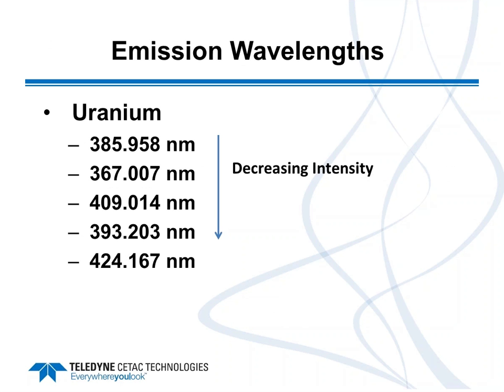So on the ICP emission system that we're going to use, the PerkinElmer system, there are 5 available uranium wavelengths, and I have listed them here in decreasing intensity. So these are the wavelengths we were initially going to look at in this very hard water matrix after spiking it with uranium.